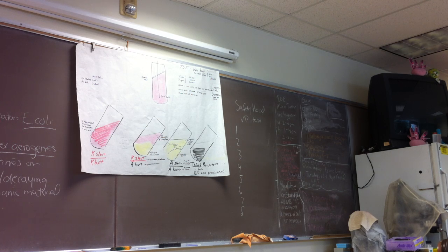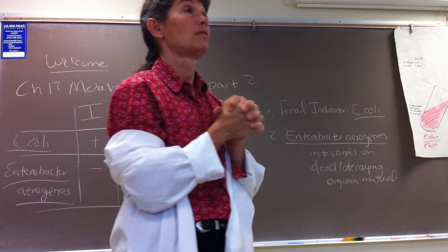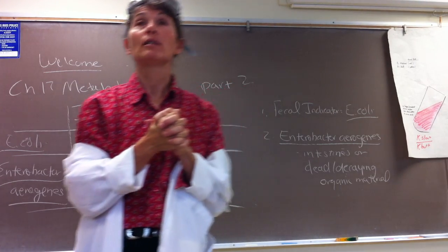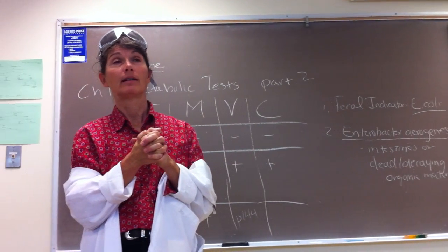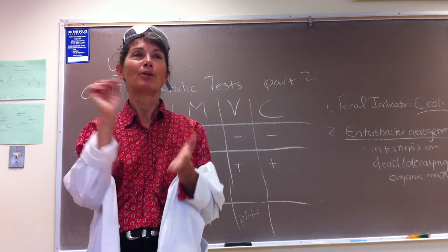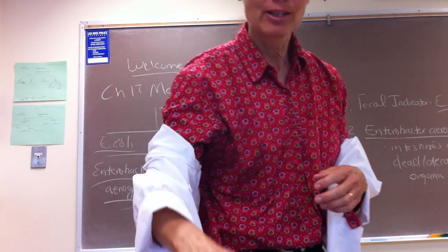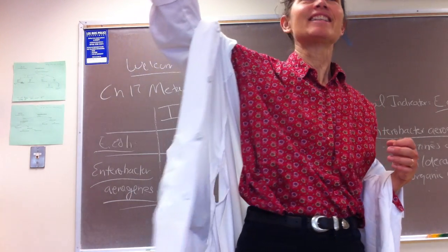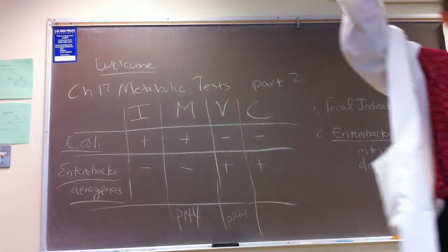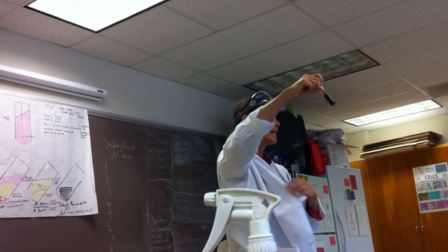All right. So we put the iron salts in there to combine with the hydrogen sulfide to make what? Iron sulfide, right? And how does iron sulfide appear? Black. Okay, and oh my goodness, you guys, your Proteus read the lab manual. I'm so proud. Look what your darling Proteuses did. Wow. Isn't that amazing? That is a huge amount of iron sulfide. That tells you your Proteus was pumping out the hydrogen sulfide like crazy.